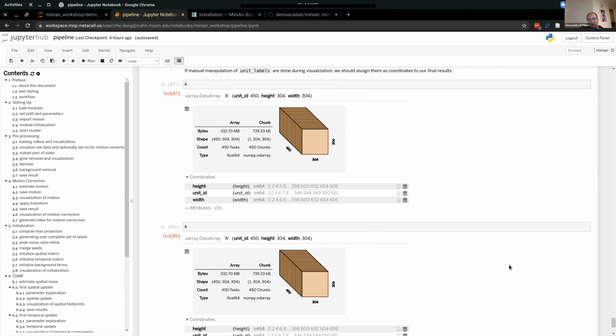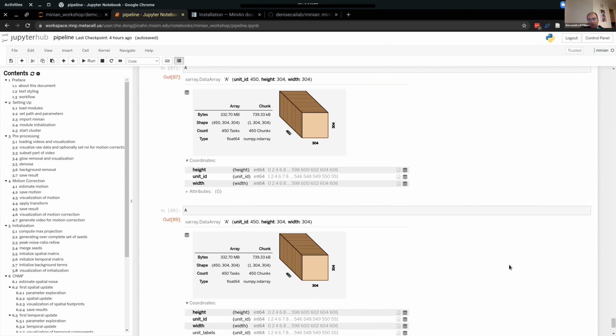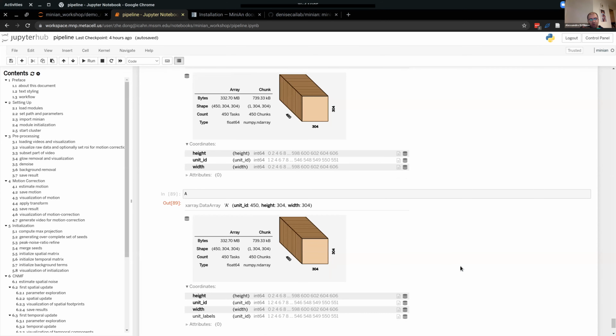But now that I'm thinking about it, Papermill gives you the possibility to save the notebook with different names, like run analysis out. So I imagine that in principle, it should be possible to change the name for each animal and session. What I don't know is whether it's saving all these visualization results or not.